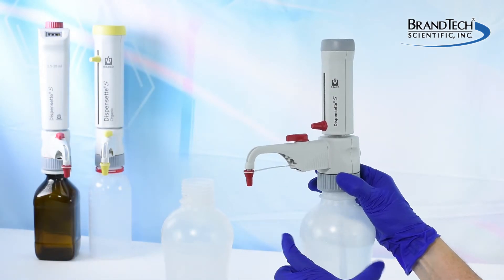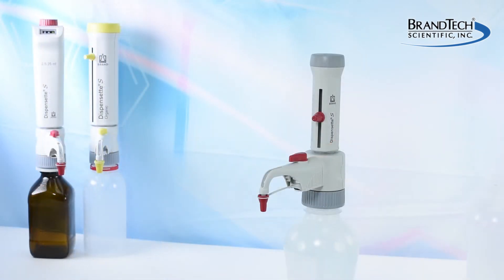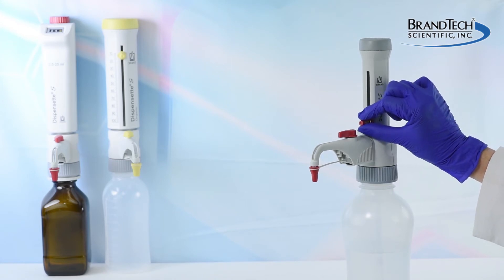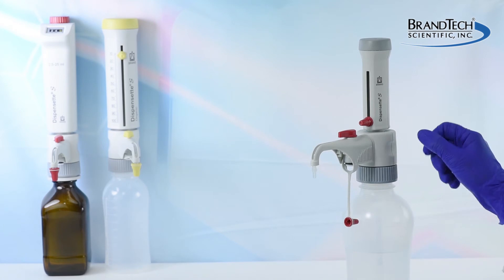Attach the Dispenset to a bottle filled with an appropriate cleaning solution, for example deionized water or an aqueous solution. Set the volume to nominal or maximum volume and dispense several times to purge the remaining reagent.